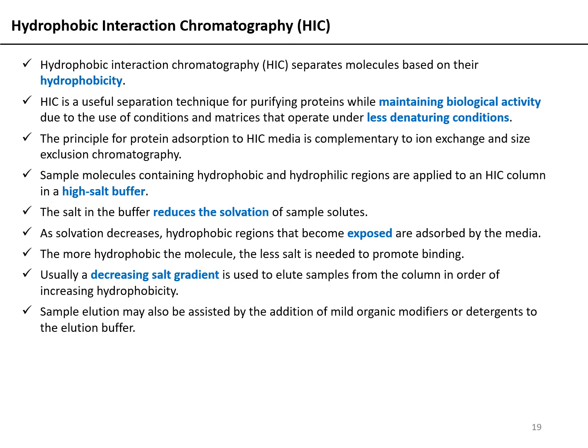Sample elution may also be assisted by the addition of mild organic modifiers or detergents to the elution buffer.